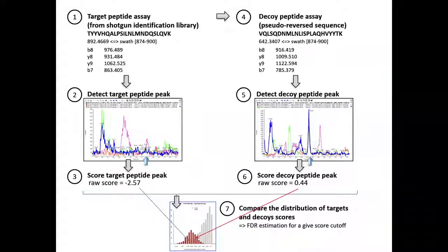It's usually pretty good because it's coming from so many proteins, so it will usually score pretty high. Then it's up to you later on if you want to use it for quant or not. But I personally never remove them from the identification step. So I run all of them through OpenSWATH, and only at the quantification step, when I'm looking at my table, I say, do I want to use it or not? But that's a different question, right?